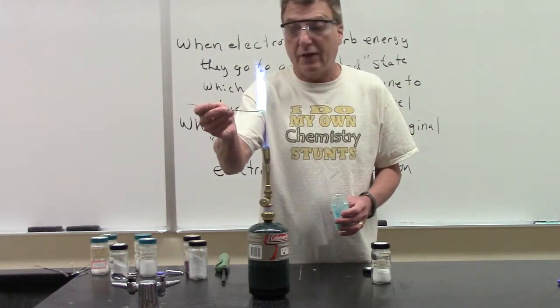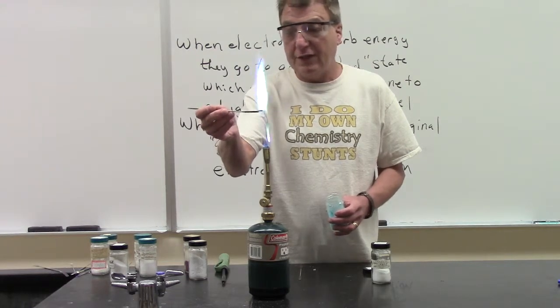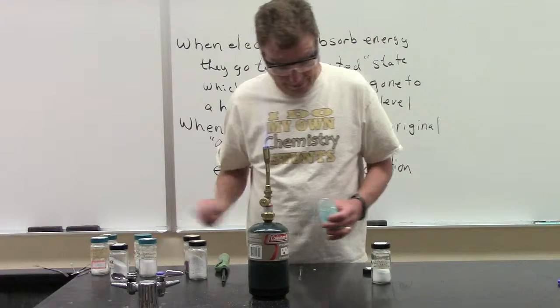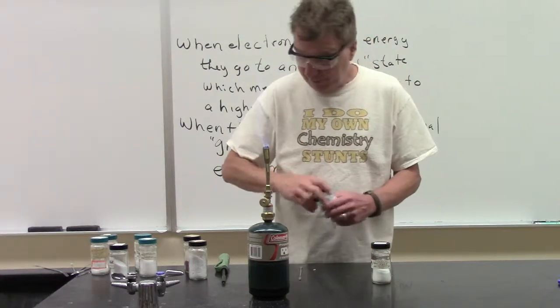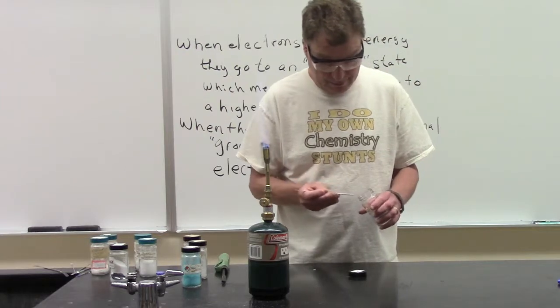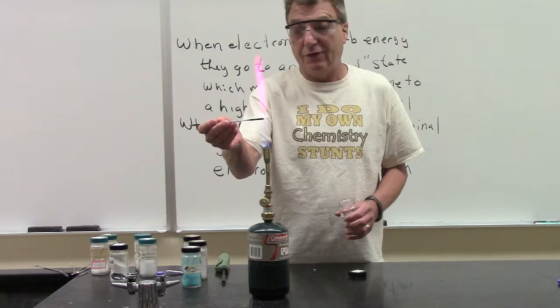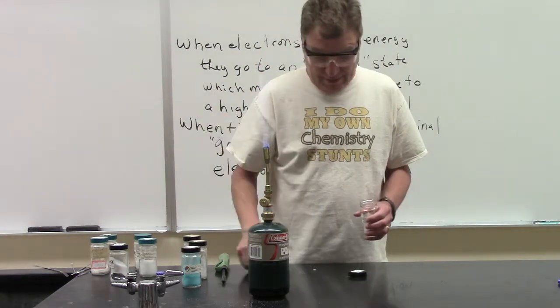Here's some copper chloride, copper 2 chloride. In a nice bluish green, very pretty. And last but not least, we'll do lithium. And it makes that beautiful, intense red. Now that's doing with solids.